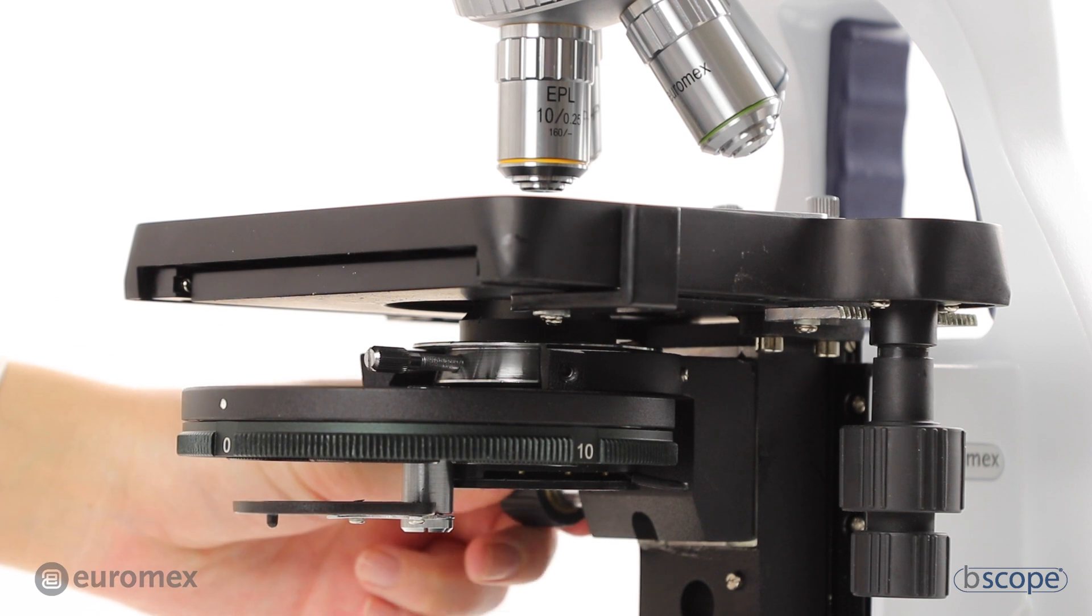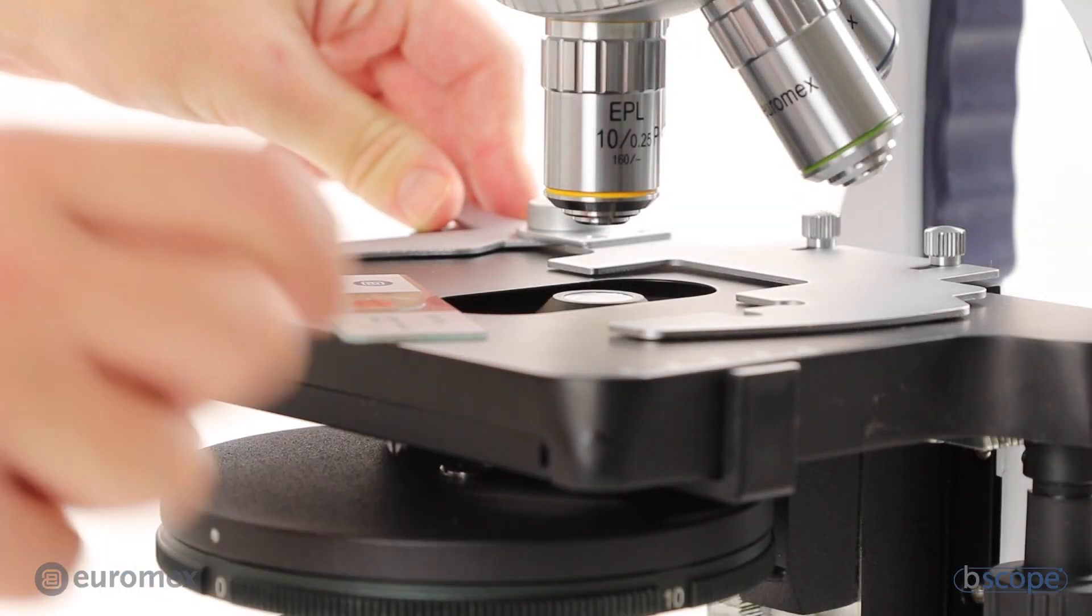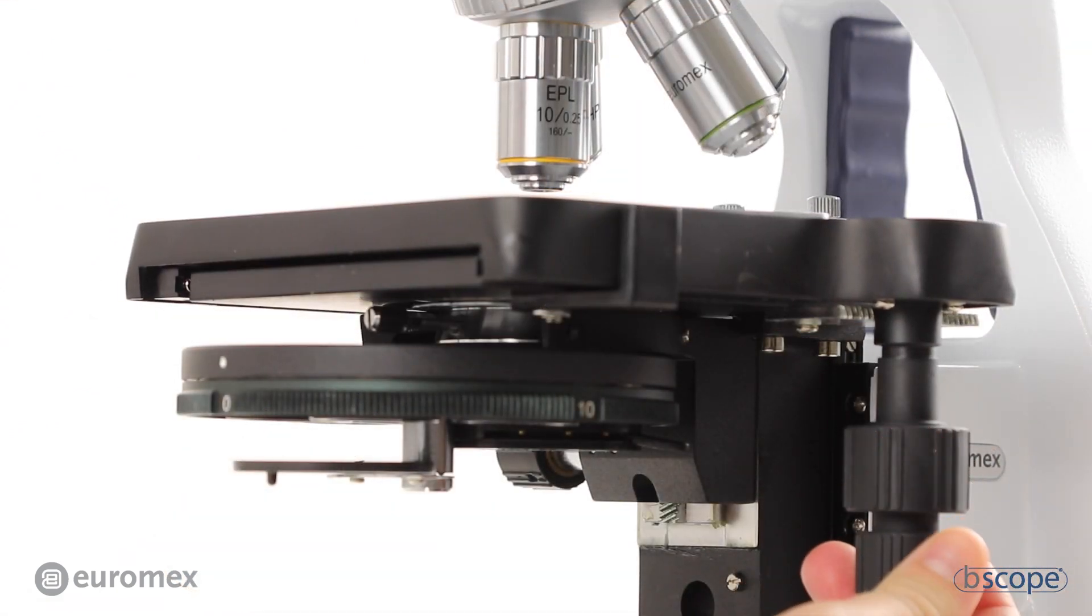Turn up the condenser, put a slide on the stage. Focus on the specimen and remove the slide.